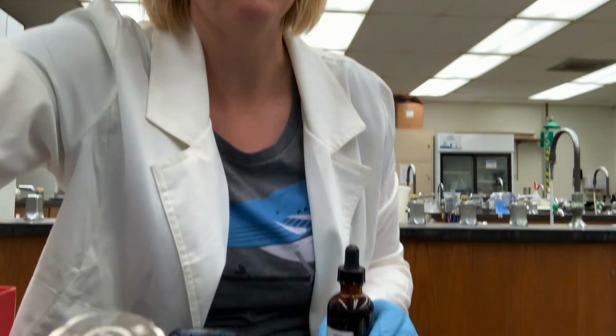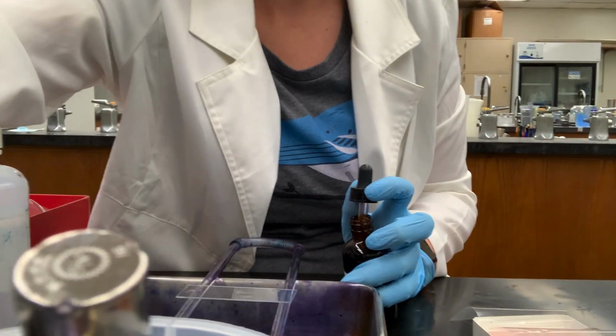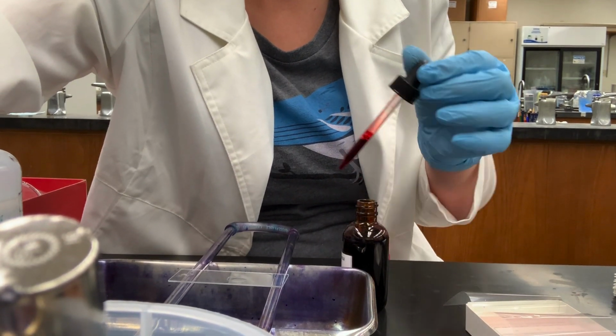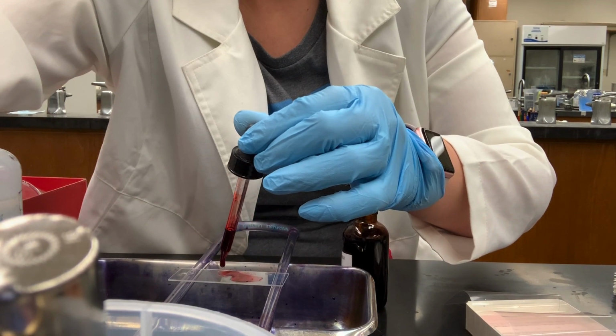Safranin only needs to be on the cells for approximately 30 seconds. So again, I'll spare you the 30 seconds. I won't make you actually watch me for 30 seconds, just sitting here and waiting. So we will again just cover the area of the slide where our cells are.